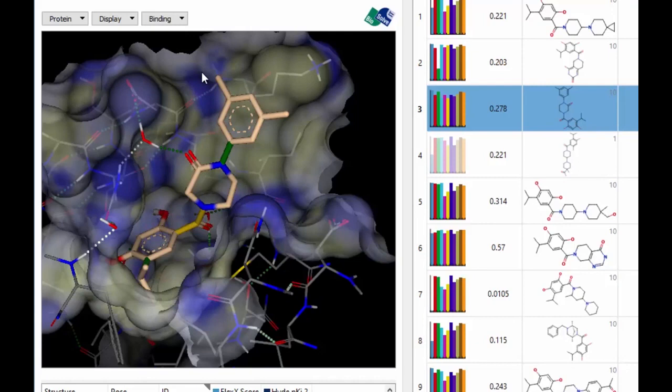Those seen frequently are coloured green. Those angles observed that lie outside the first tolerance interval, i.e. those seen less frequently, are coloured yellow. Any bonds coloured red reflect highly unusual torsion angles, which are therefore questionable.